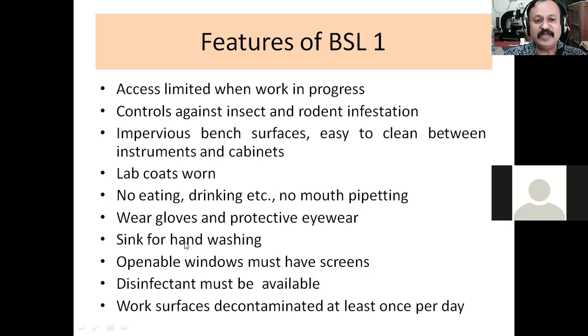And then there should be a sink for washing the hands in the laboratory itself, so you do not have to go outside, or go to the washroom, for washing your hands. And then even if your windows are openable, they should have screens so that dust will not come inside because of the breeze which may be flowing.